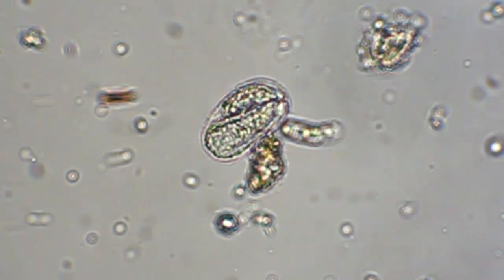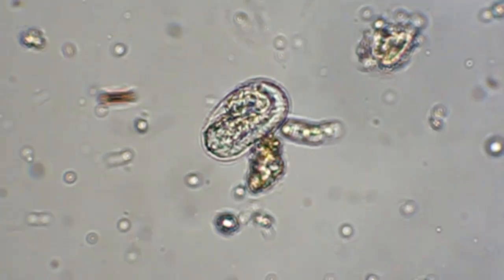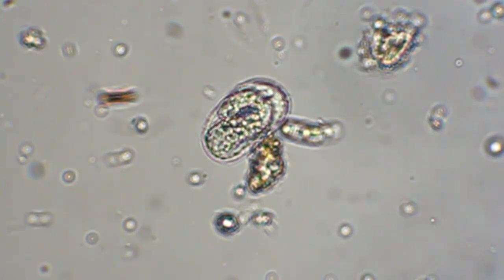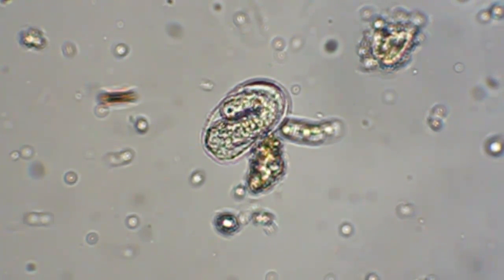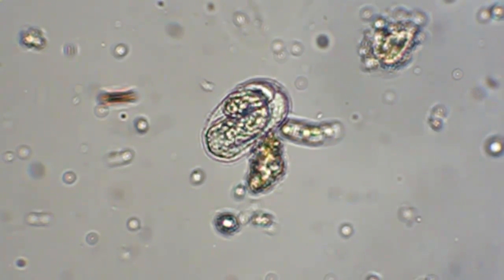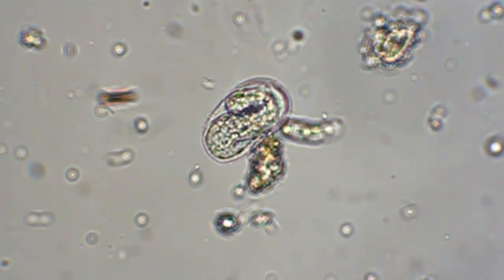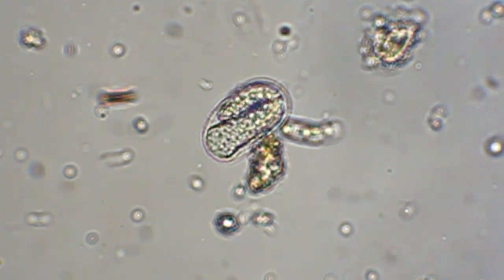I'm using a Canon T1i in video mode at 720p, shooting through a Nikon Fluophot microscope using an E40x objective with a camera adapter and a 10x objective projector lens inside the adapter. So this is roughly 400 power plus the 1.6x sensor crop, making it a little over 600x — about 600 power.